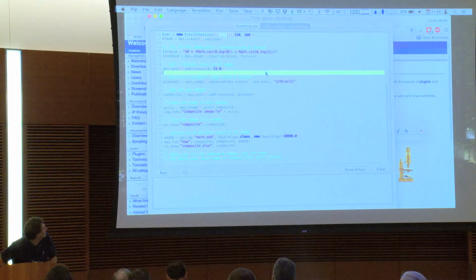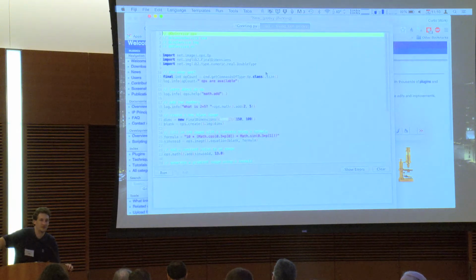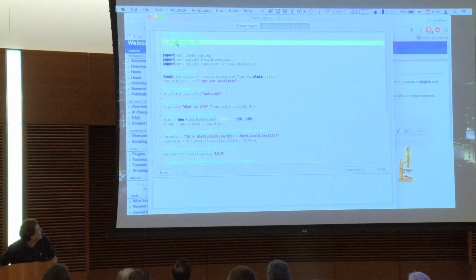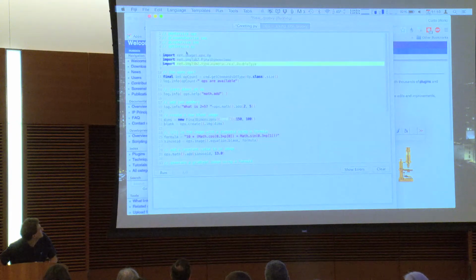So the rest of this talk is going to be predicated on the idea that you understand the parameterized scripting and, to an extent, the services in general. So you probably noticed those services were also auto-filled, right? It didn't ask me to choose a service because that doesn't really make sense. So these inputs are just giving you access to those with names. They're like imports almost.